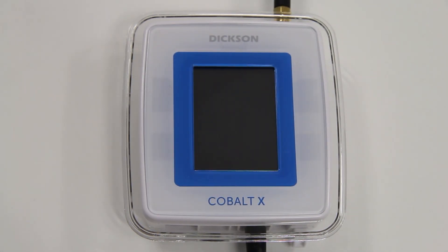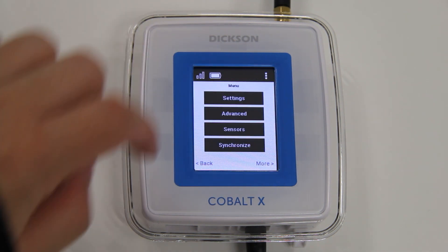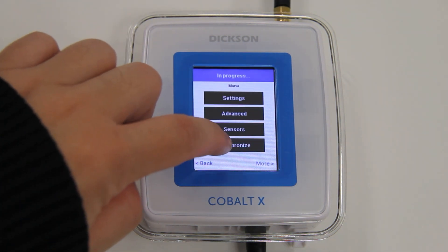The first step is to synchronize the data on the unit with the server. Press the menu icon, then press Synchronize and wait for that operation to complete.